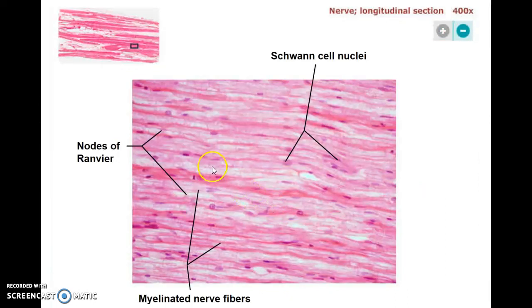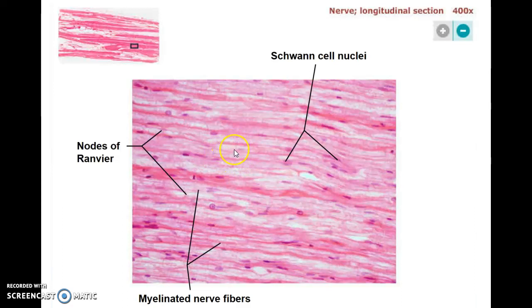Even more up close now: if you slice across something as thin as an axon along its length, you're going to just barely see for some regions the shadow of that axon. There's the shadow of that axon — and they're surrounded by the whitish myelin material and the Schwann cells. You can even see some of those Schwann cell nuclei surrounding the axon.